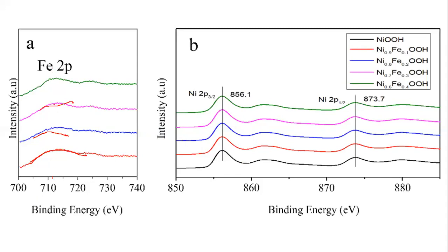And that data is well established, already developed by a lot of scientists. They have worked hard, and now we can easily measure because we know the baseline. We just take our sample, go to the lab, characterize it, record the spectra, and then come to our office or our room, zoom it and check it one by one, compare it, and we can understand.